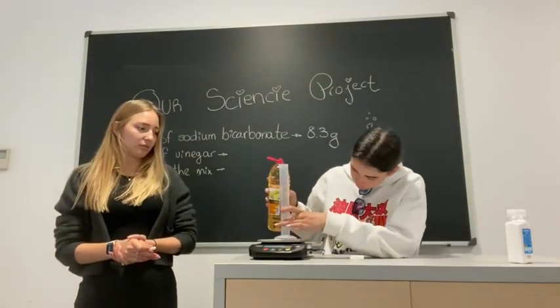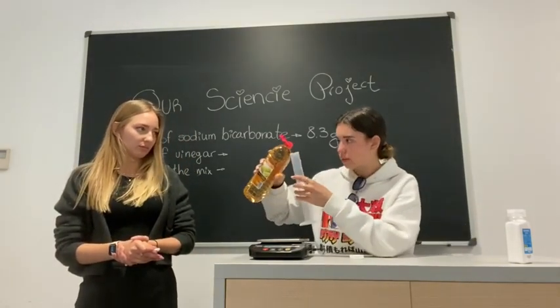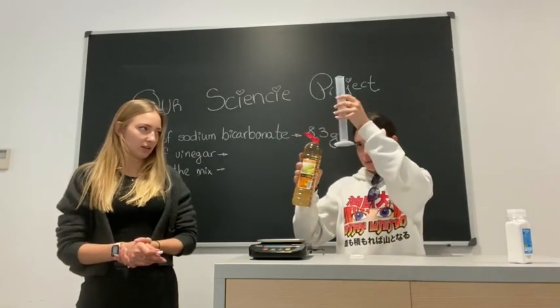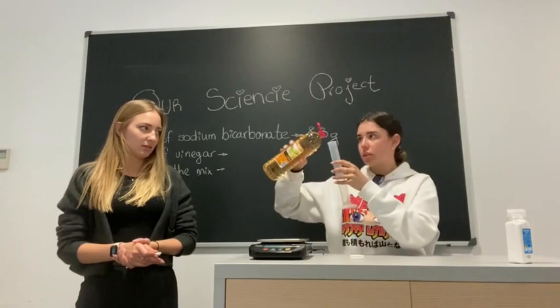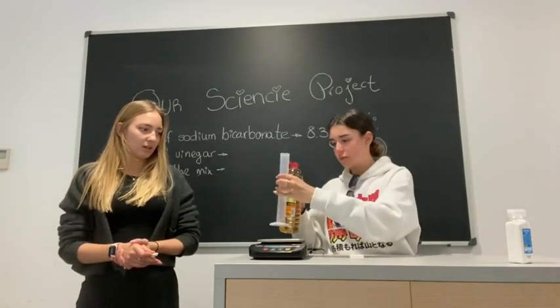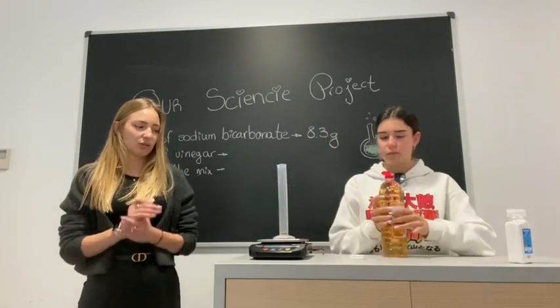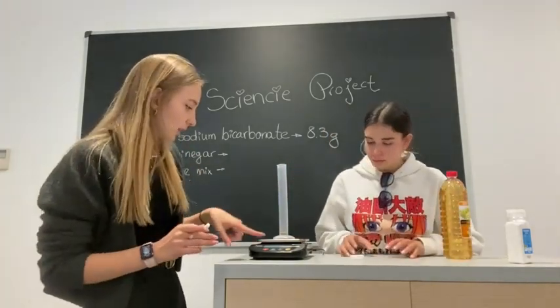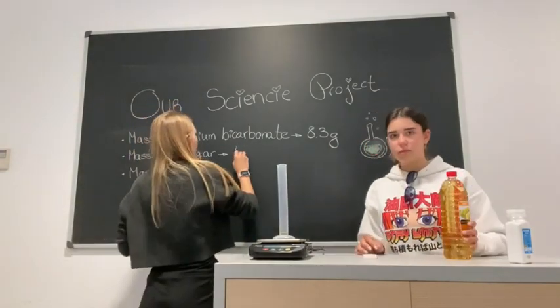More or less 5. We're not going to take a lot of it, so we can actually see the reaction. And the weight is 4.4.